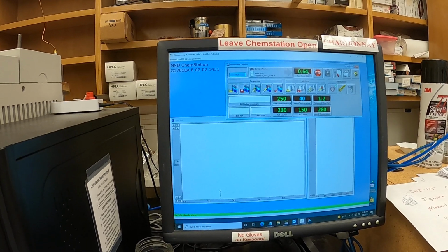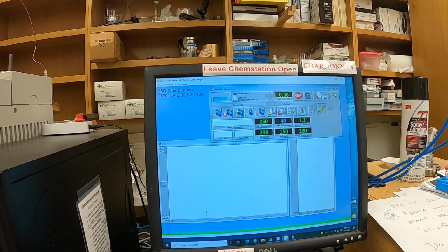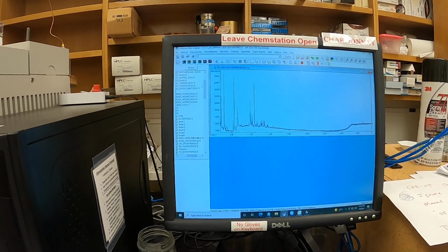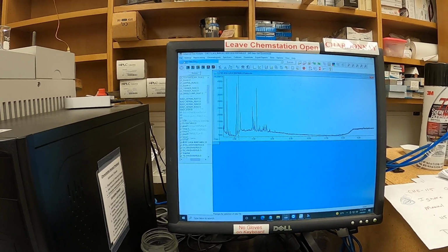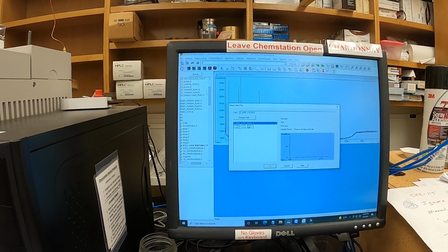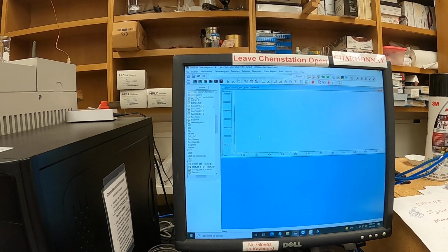All right, so we're not going to see any data until about 3 minutes. In that time, let's come over and look at this data analysis. So file, let's load data file. Hey, standard 1 is already there. It was run 2 that was a good one.